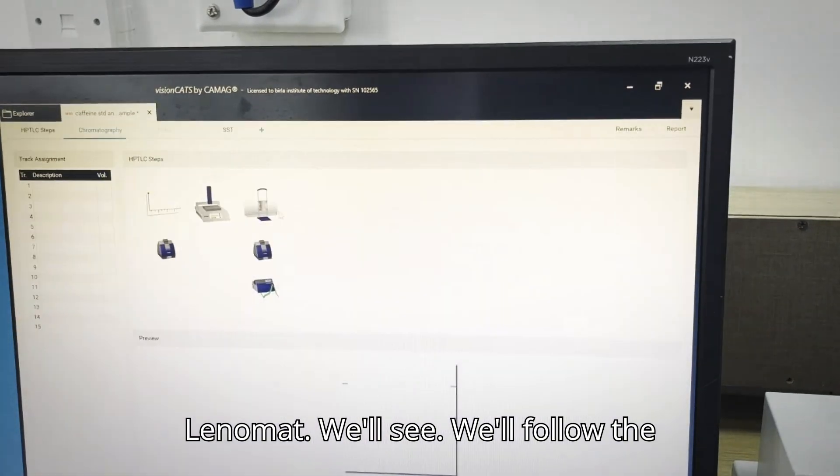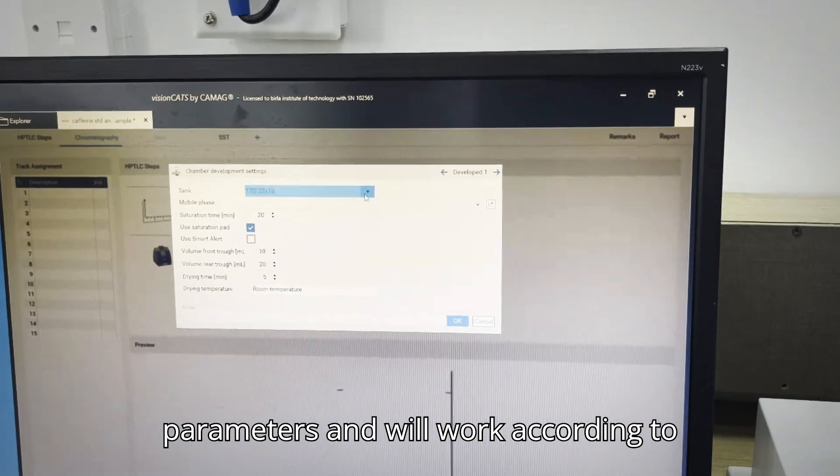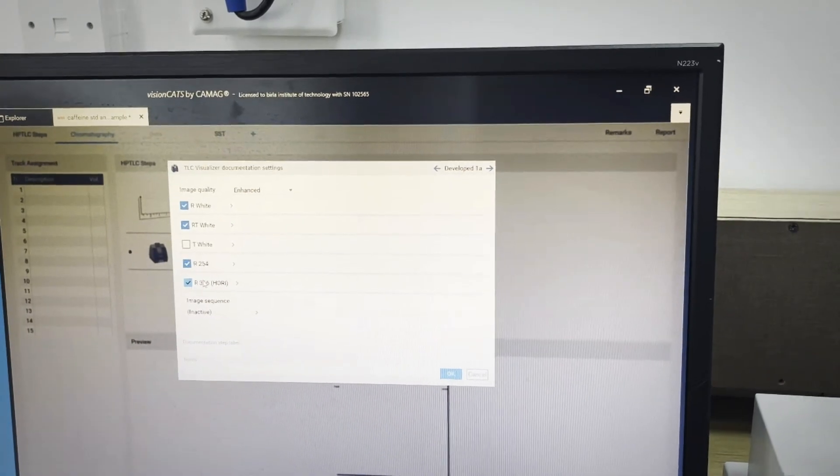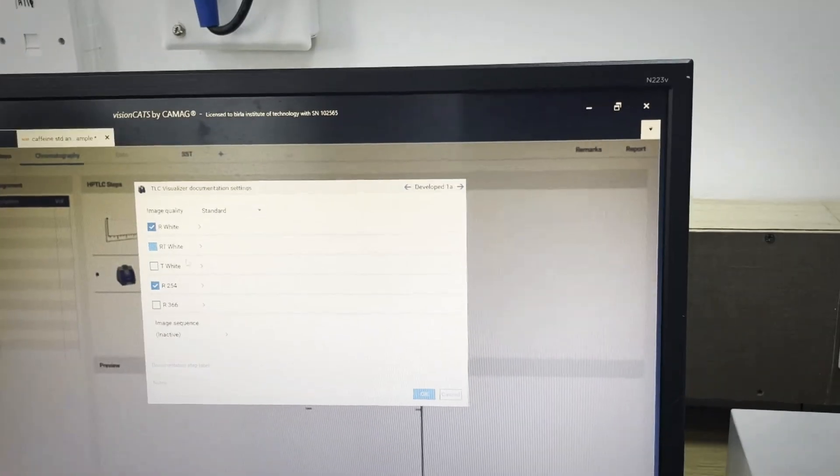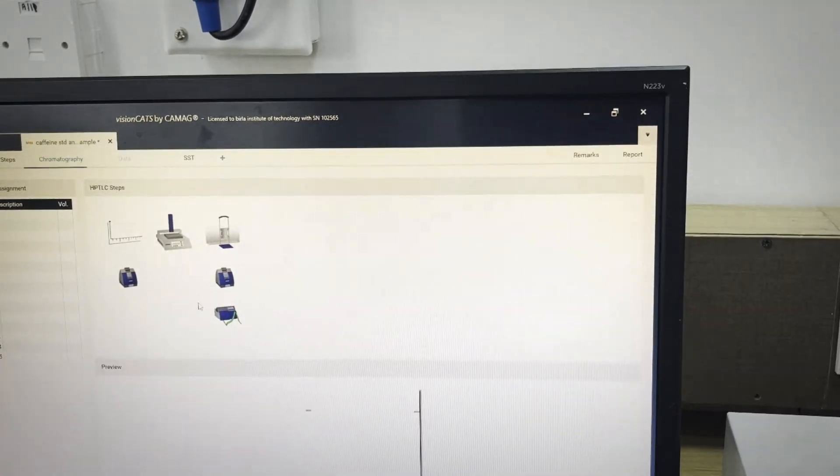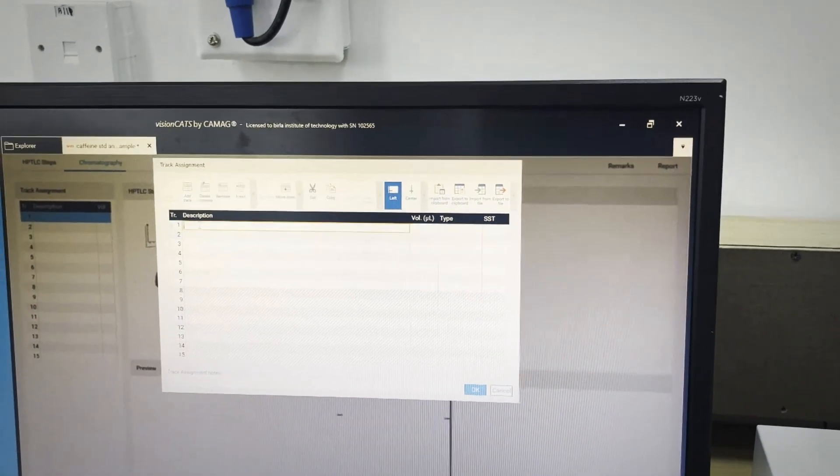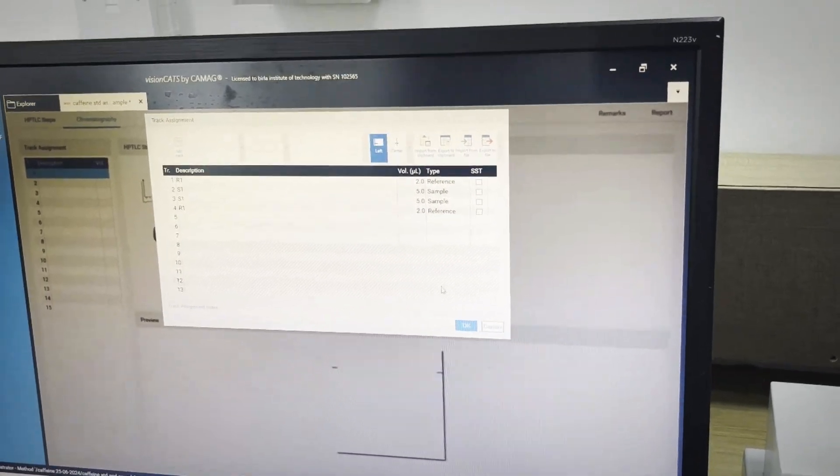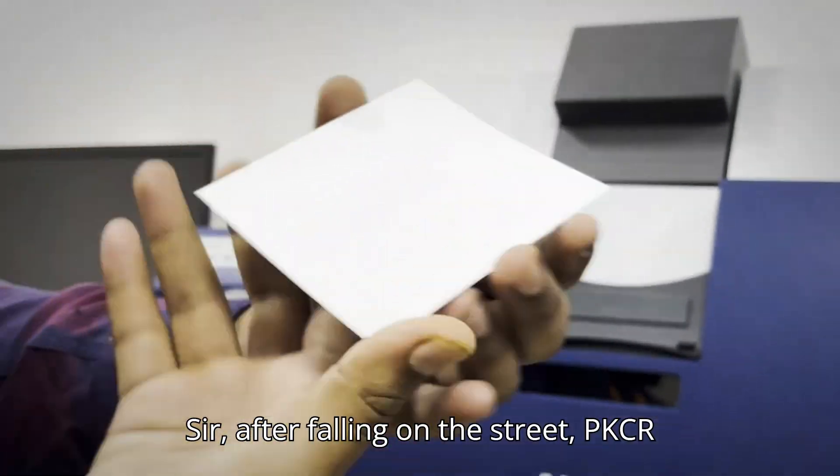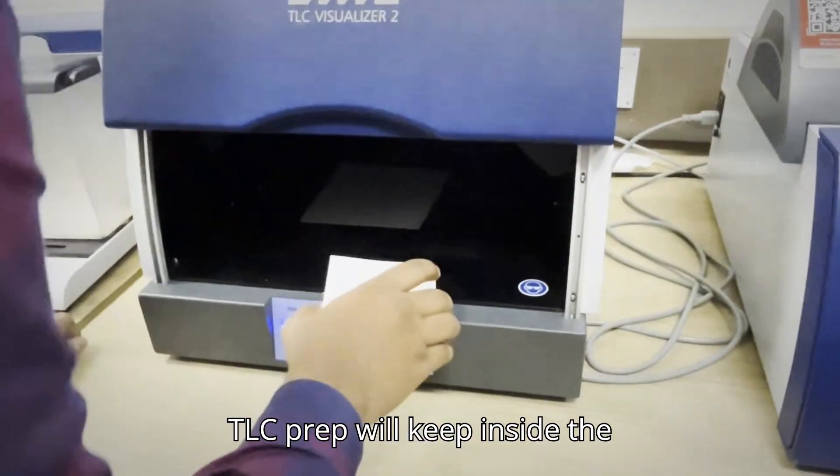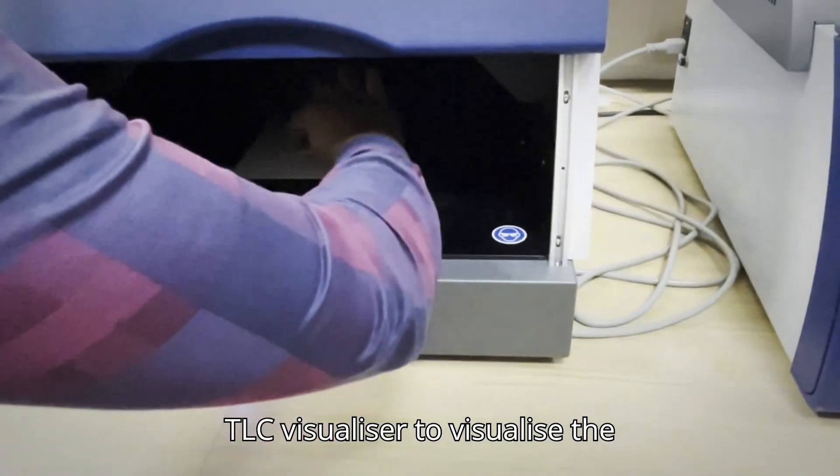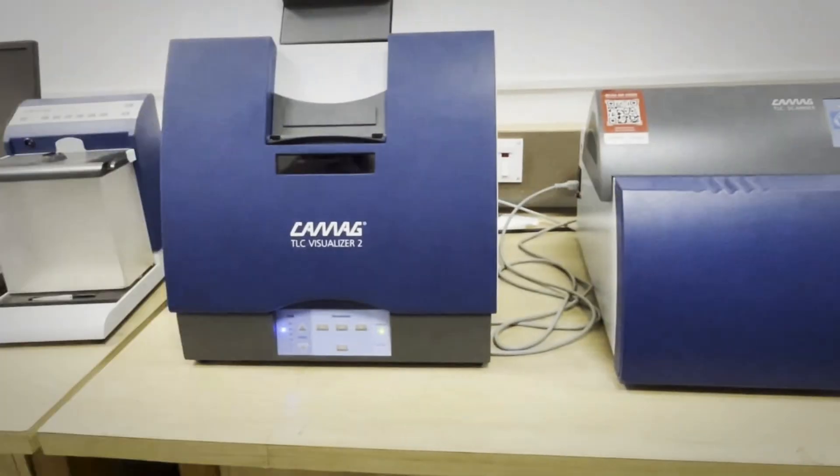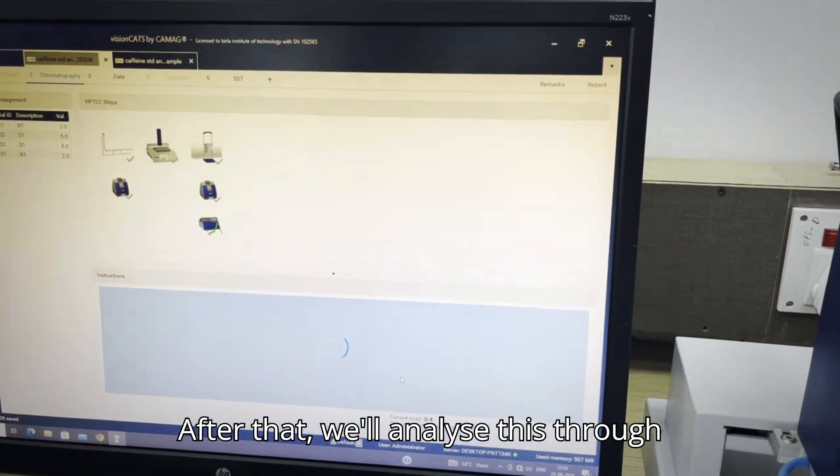Now we will move to the Linomat. We will follow the following parameters and we will work according to that as shown in the video. After following all the steps, you can see that this is the TLC plate. We will keep inside the TLC visualizer to visualize the plate. After that we will analyze this through the software.